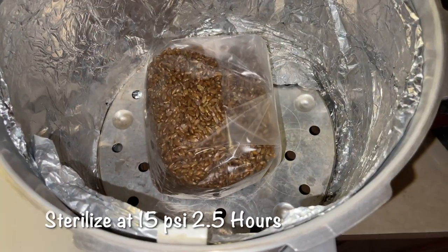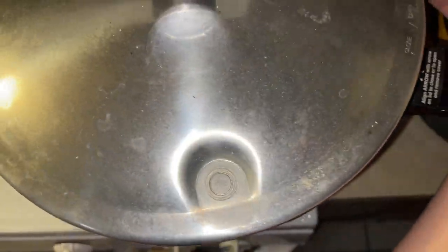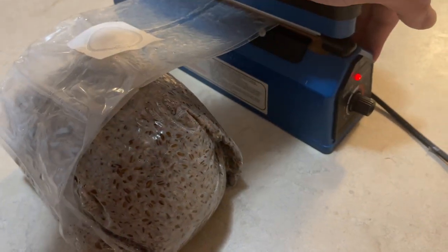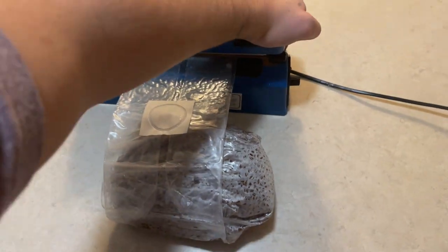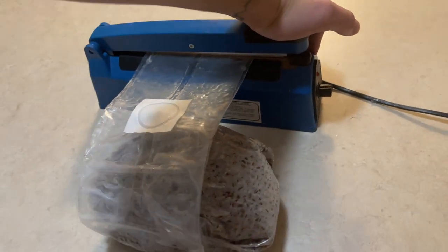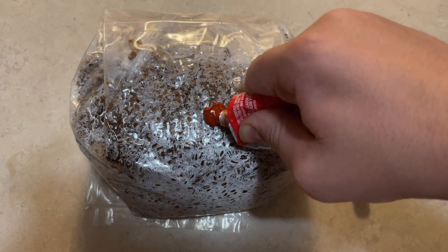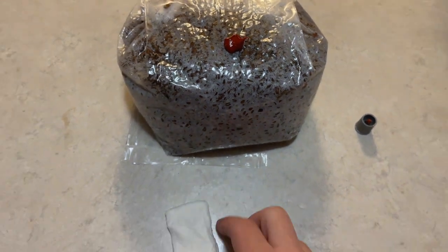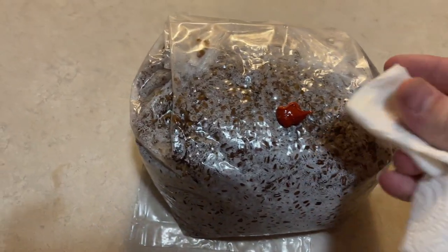At this point, the grain spawn needs to be sterilized for 2.5 hours at 15 psi. After the sterilization cycle, you can use an impulse sealer to seal the top of the bag. Red RTV silicone is used as a quick injection port, and tape is laid over top of it to secure it to the bag.